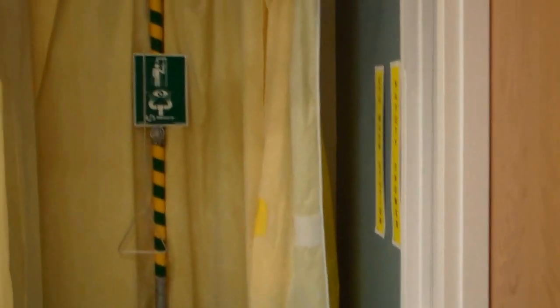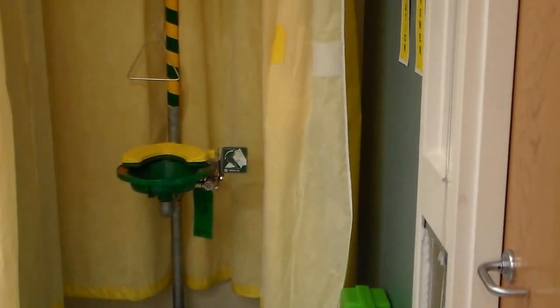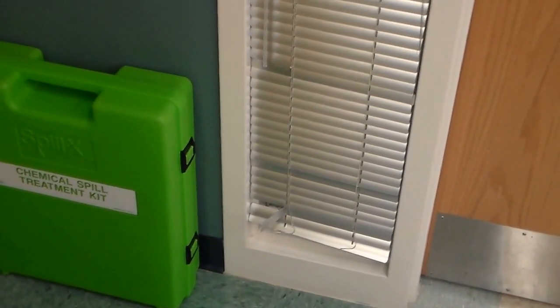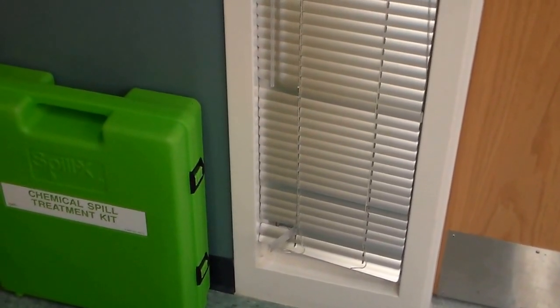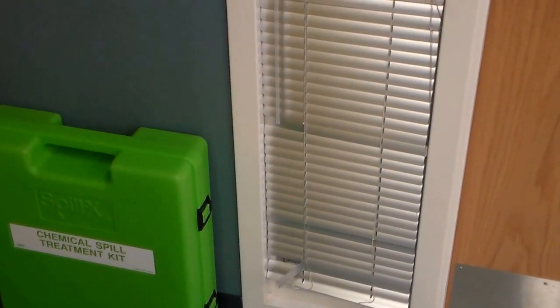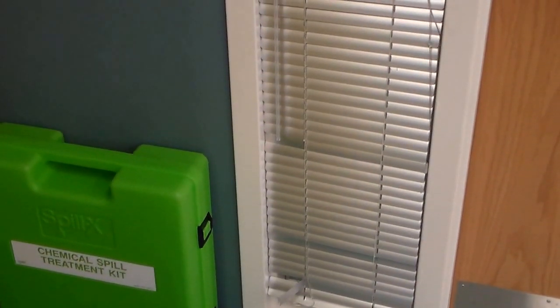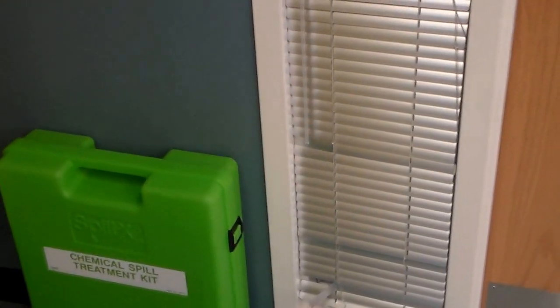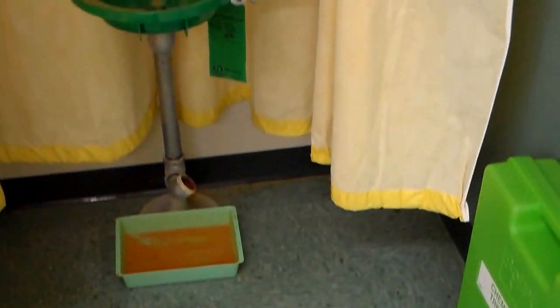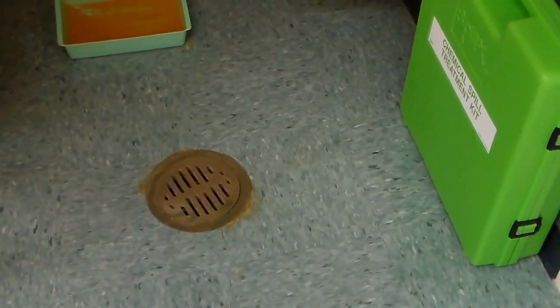Coming along from there we have our lab safety shower and eye wash station by this door to the room. We also have our chemical spill treatment kit. Again, faculty will typically handle that. If there's a spill and for some reason the faculty can't handle that, maybe we're knocked out, you pour the kitty litter around the spill and then over the spill. You'll notice the floor drain and the eye wash station that's right onto the floor to go into the floor drain.